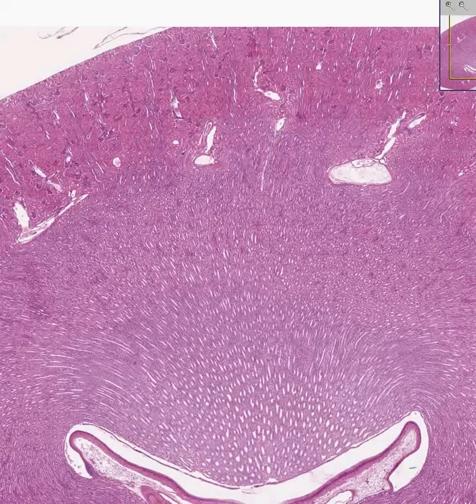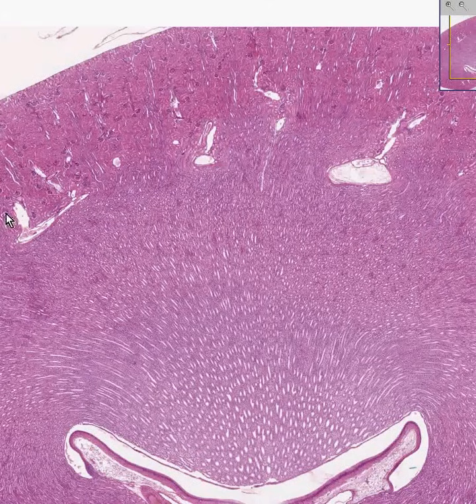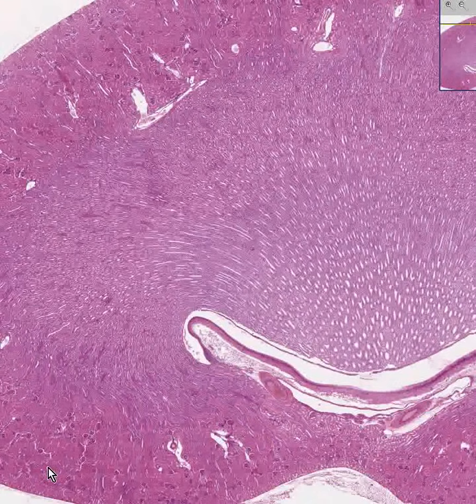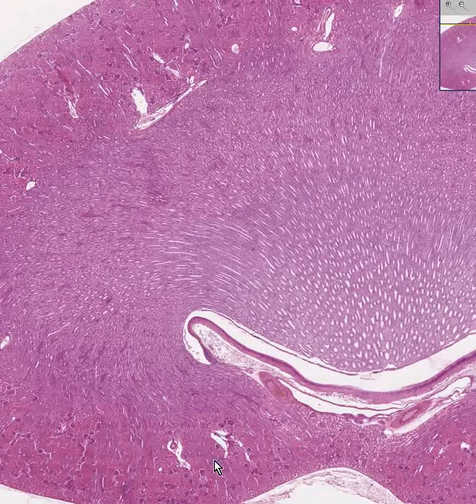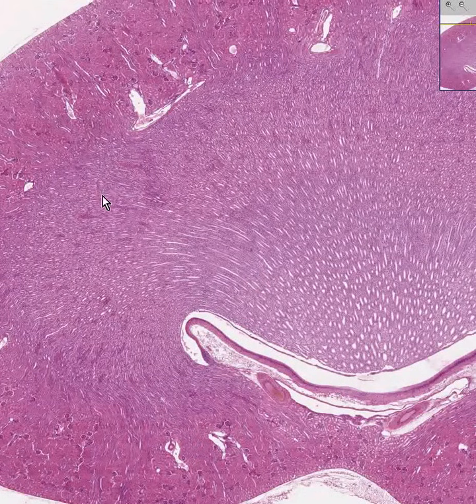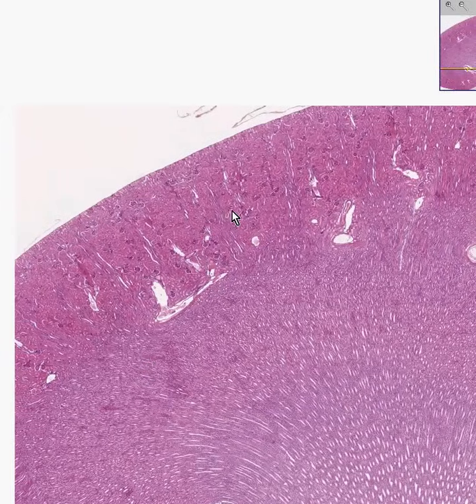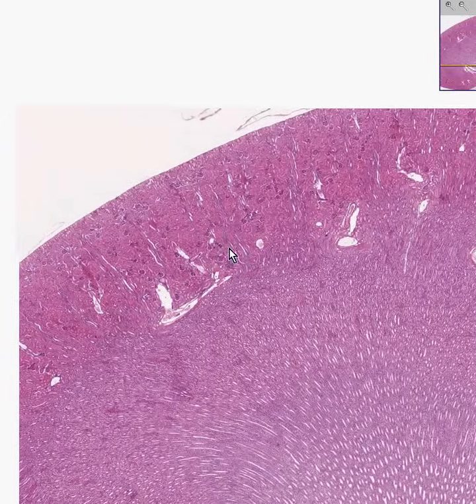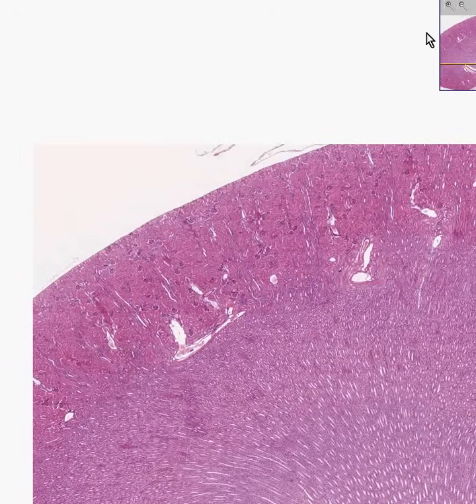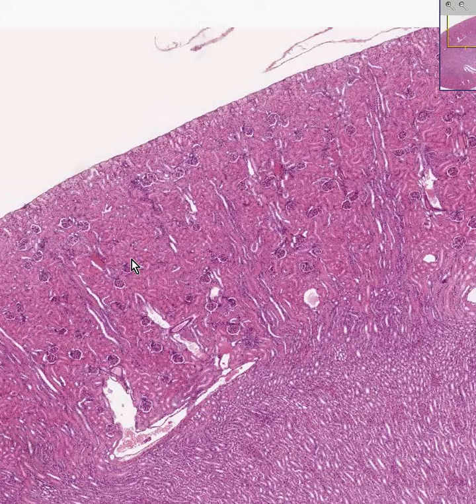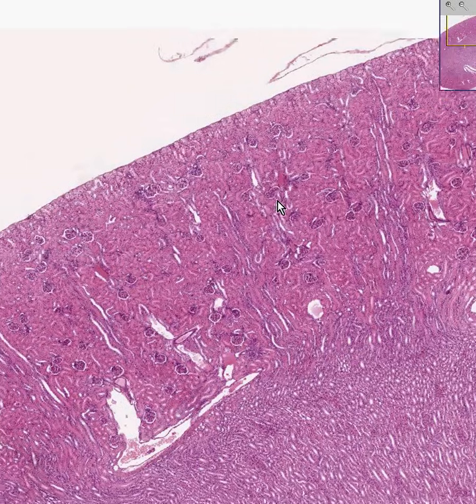Here is your medulla, which is pyramid-shaped, and here is your cortex. Sometimes the cortex dips between the pyramids — that is known as the renal columns. Let's take a look at the cortex first, then the medulla. The cortex or cortical tissue is always quickly identified by the presence of numerous glomeruli.